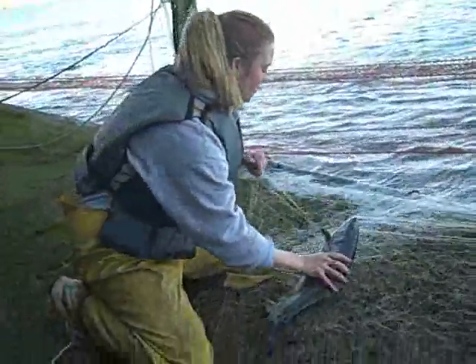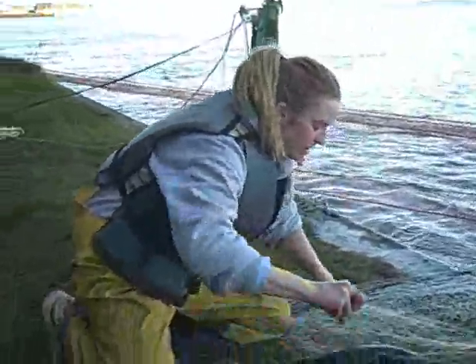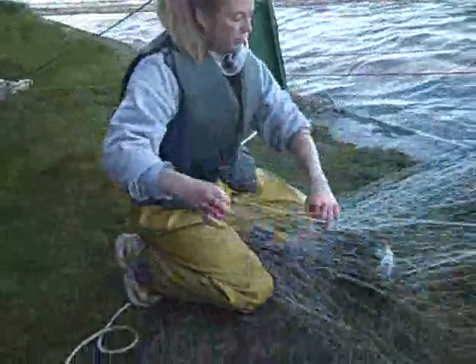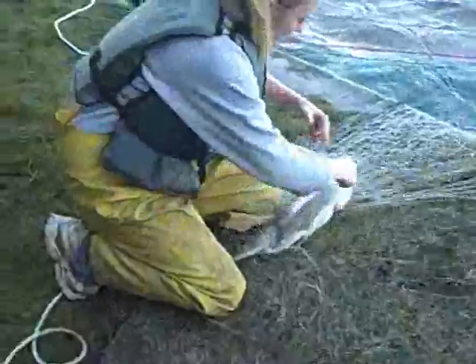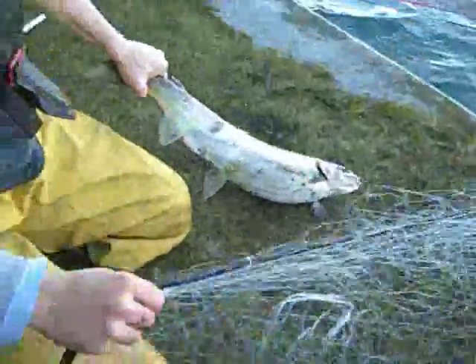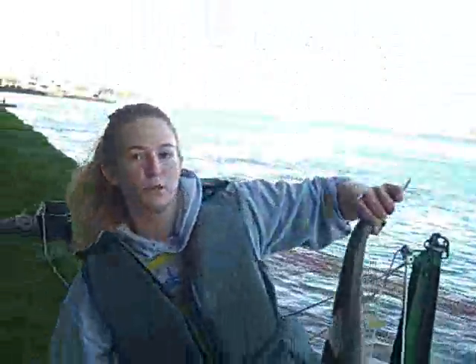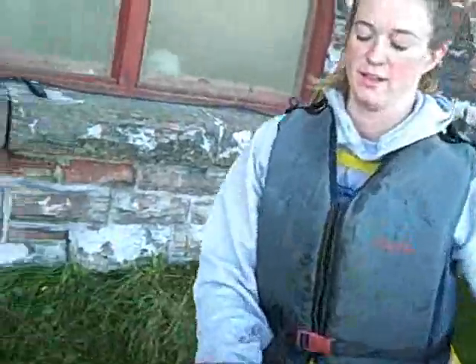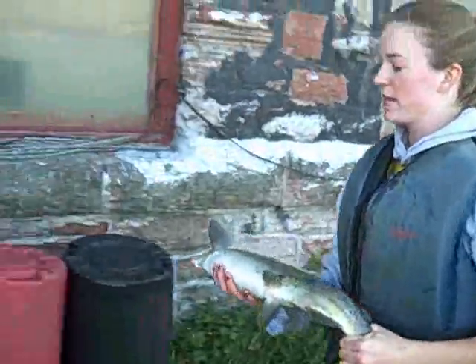We're taking brood stock for our fish for next year. Pretty much what we do is we net all the fish right here and then we take length and weights, which we'll do inside. This is a female Atlantic salmon. We'll take her inside.